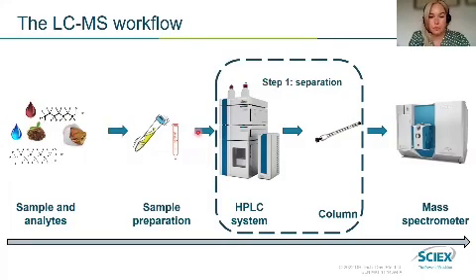are important as well as the sample preparation. However, today we're mainly going to focus on step 1, which is separation. So we're going to talk a little bit about the HPLC system and talk a bit about how the column chemistry can affect our separation too. And then we'll go on to step 2, which is our mass spec. So the next few slides are mainly going to focus on step 1, which is our separation.